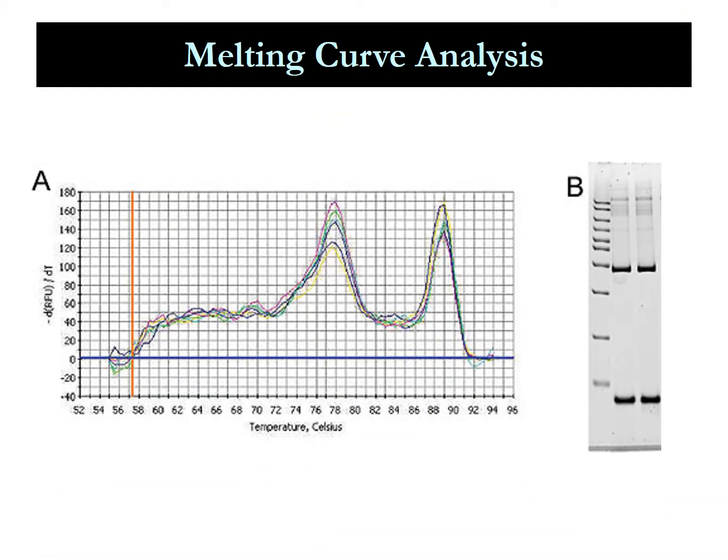One of the ways in which non-specific amplification can be detected is melt curve analysis. Subsequent to the qRT-PCR process, the sample can be subjected to melt curve analysis. An indication of improper PCR amplification or non-target amplification is the presence of two peaks in the graph.